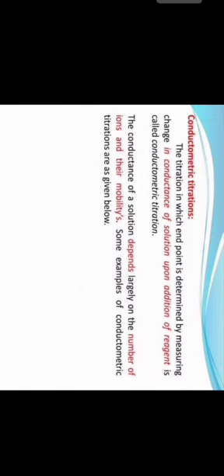Before looking at conductometric titrations, let's understand the basic concept of conductance. Conductance is the ability of a solution to allow the flow of electric current. It depends on the presence of ions. The more ions present, the higher the conductance. This principle forms the basis of conductometric titrations.